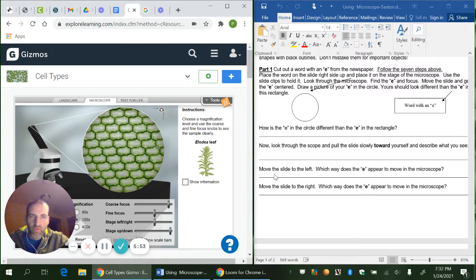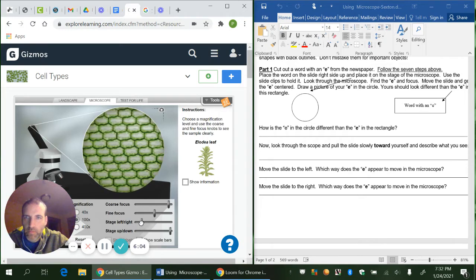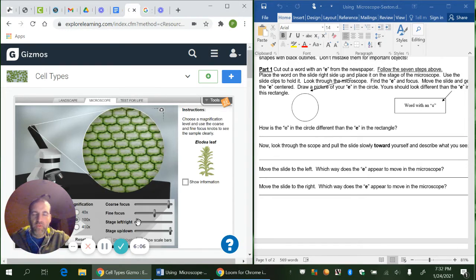The next one says, move the slide to the left. Which way does the E appear to move in the microscope? So if I move this slide to the left, what does it do? Does it look like it's moving left? No. It's going the opposite direction. It's moving right. So pause the video, write that down. It looks like it's moving right.